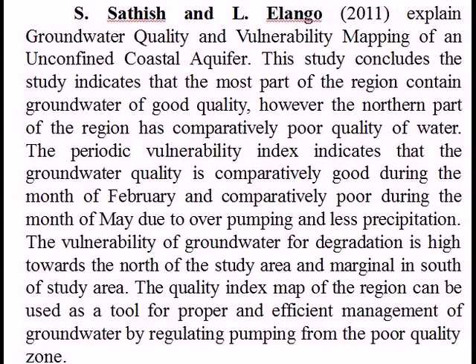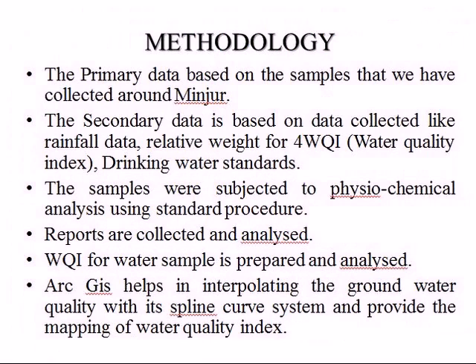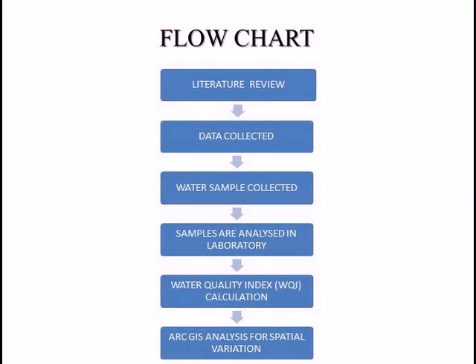Next, move on to procedure for sample collection. Water for chemical examination should be collected in a clean white 2-liter polyethylene container. The source from which water is collected should be in regular use. For a hand pump source, the water should be pumped and washed at least 3 to 4 times to clear all dirt. Water from a well should be taken in the middle of the depth.